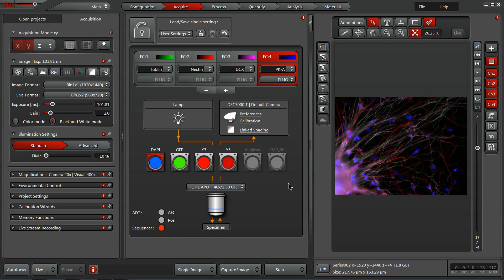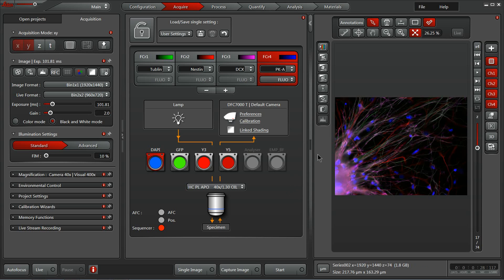Now let's take a deeper look at the Acquire tab within the LASX software. Notice that it's broken into three distinct panels: the far left panel, the center panel, and the right image display panel — all of which allow you access to different things very easily within the software.